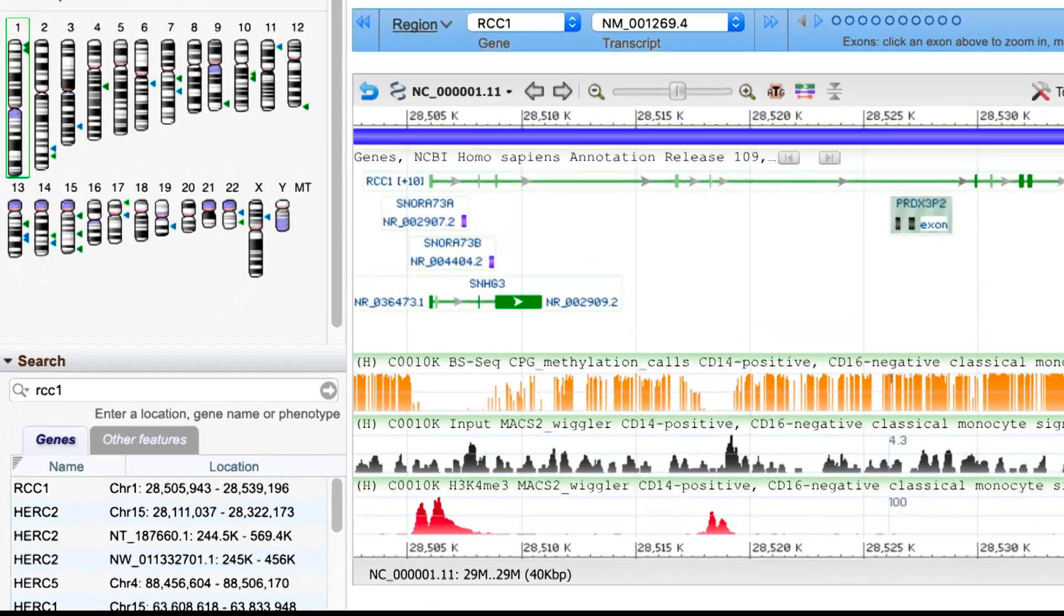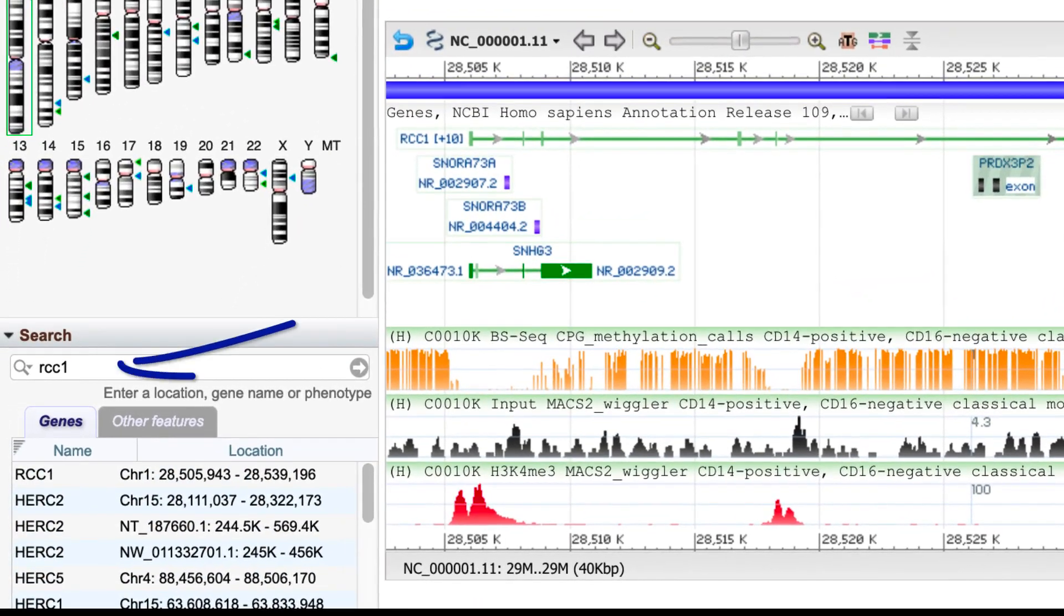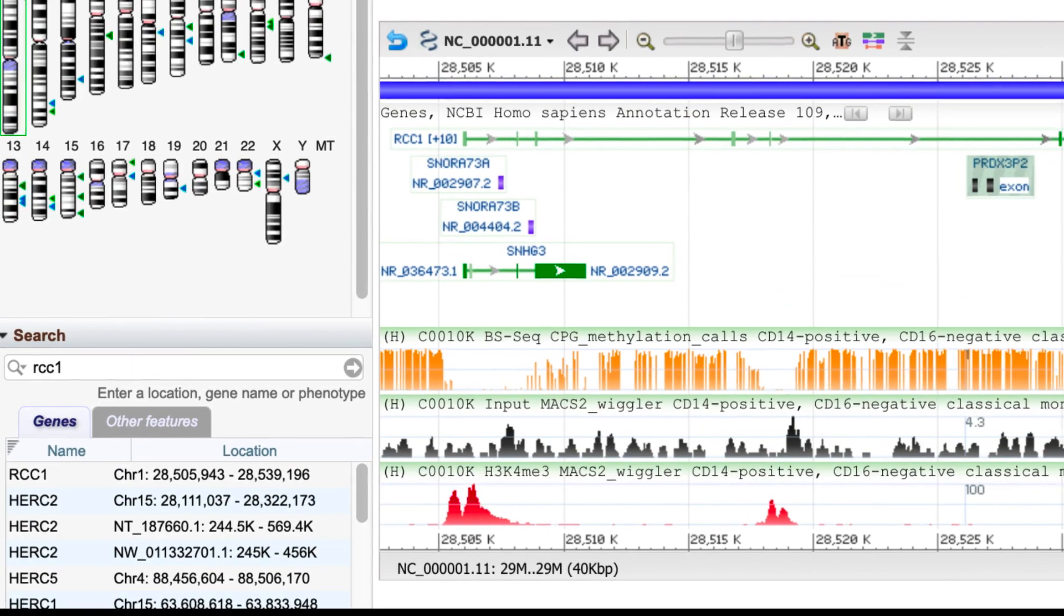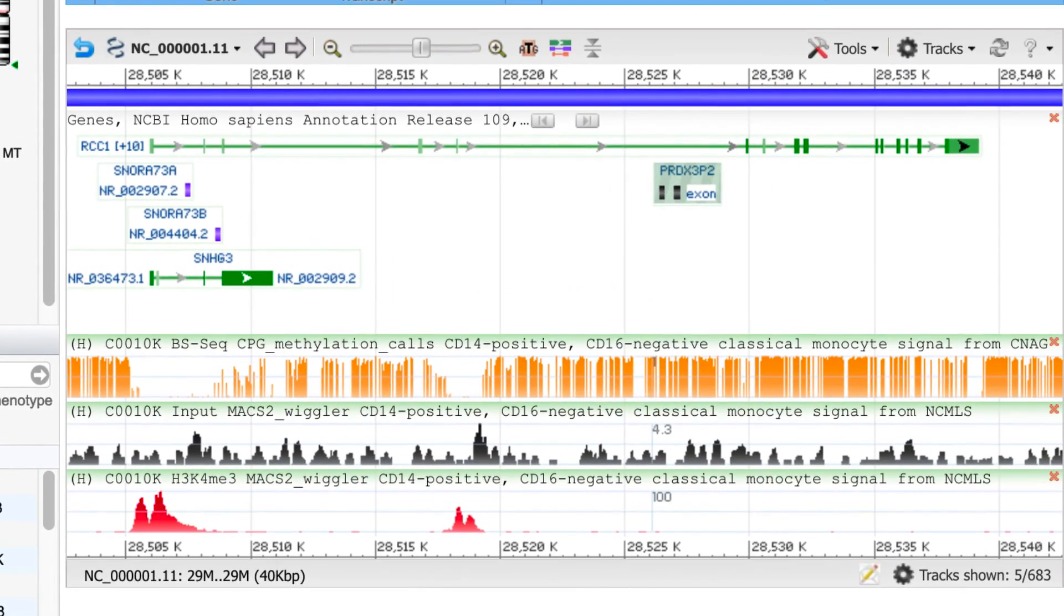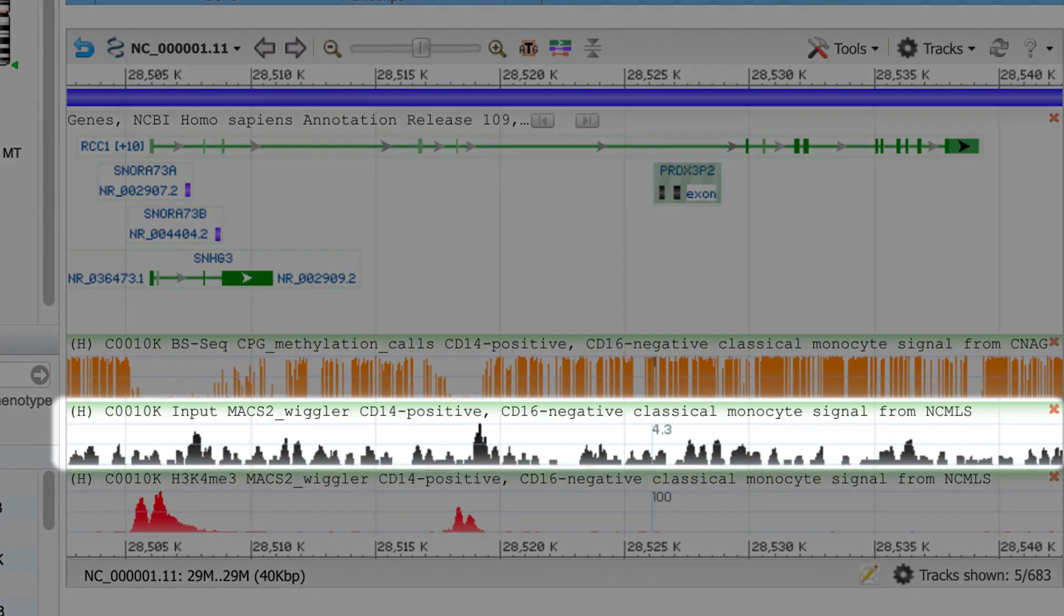I used the Search widget to go to the region of the RCC1 gene, mostly just to zoom in a bit. And let's say you want a cleaner view of the peaks in this middle track, which now has a maximum value of 4.3 in the default linear scale.